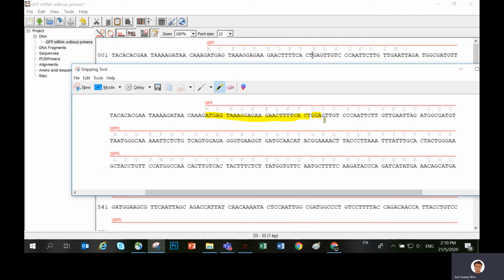The next codon, GTT, is split, because the first G forms a new codon with the previous two nucleotides. Then the new codon starts from TTG. So this is again a frame shift mutation, because the reading frame changed.